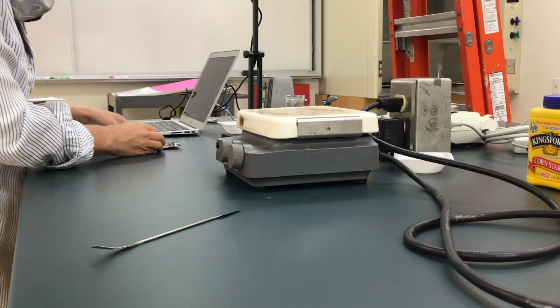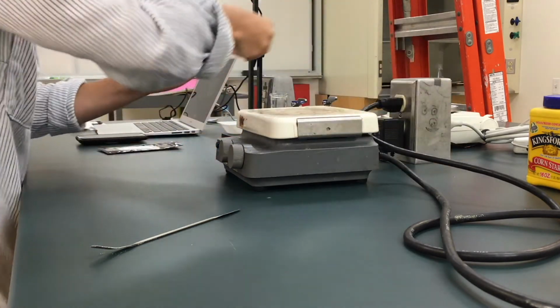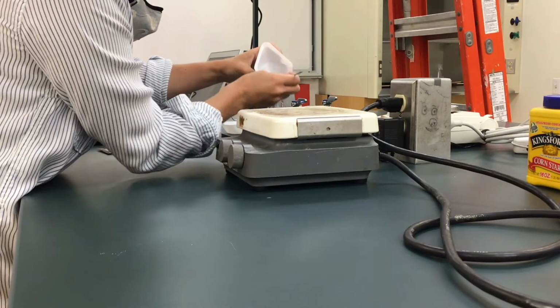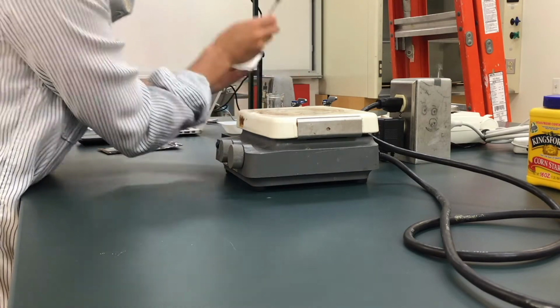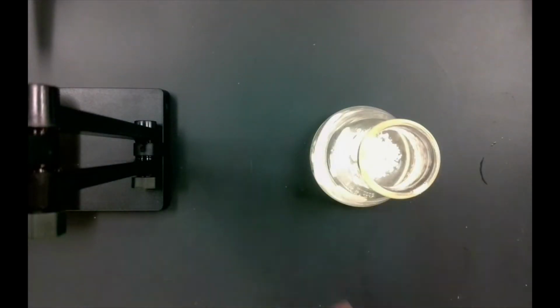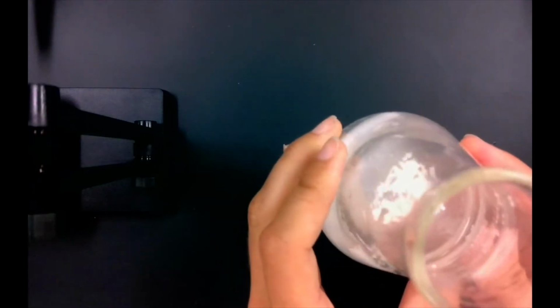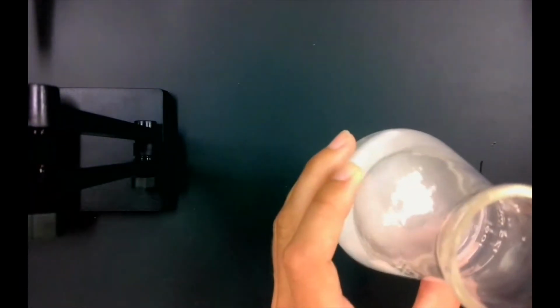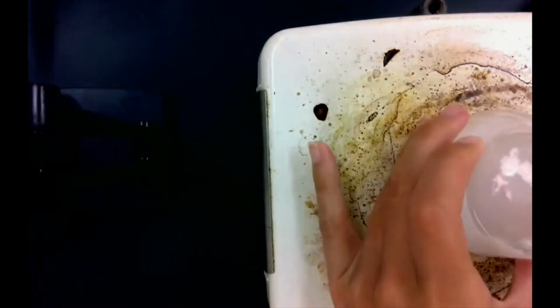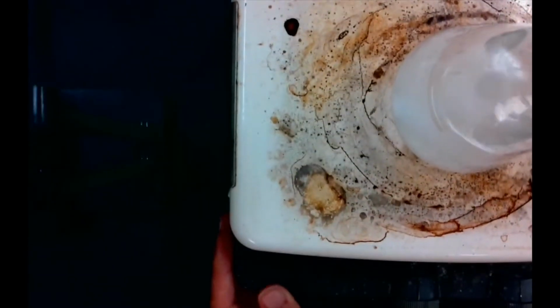The last thing I'm going to do to prep the solution is put our cornstarch in. As you can see, our cornstarch is having a difficult time dissolving. So we are going to put it back on the stirring plate to make sure that we mix in that starch as much as we can to get it to dissolve as well as possible.